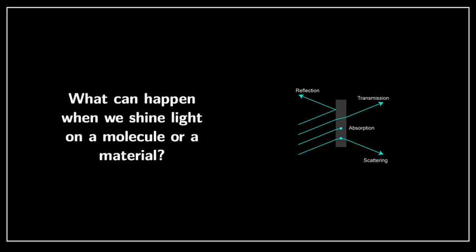What we are interested in Raman spectroscopy is to analyze the scattered light as it goes out. So this is what we usually do. If we have a material that is very highly reflective, Raman spectroscopy is complicated because most of the light is reflected, and clearly we do not have a strong Raman spectrum. So this is something to remember as well.